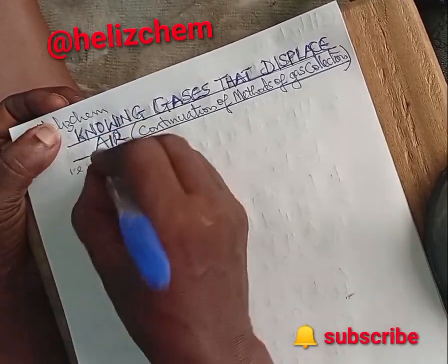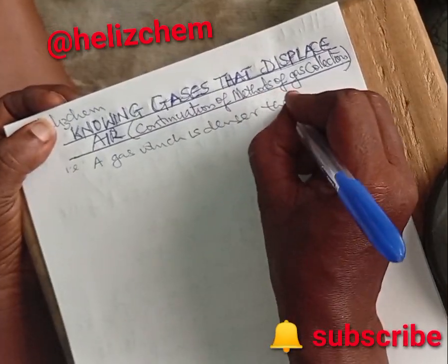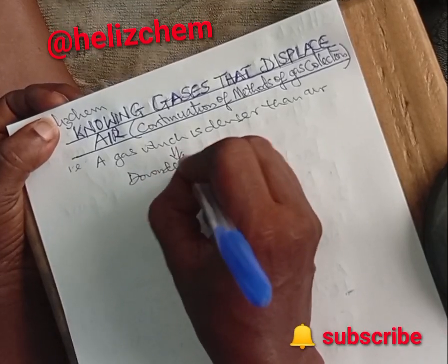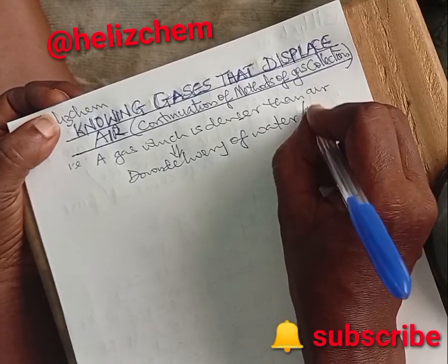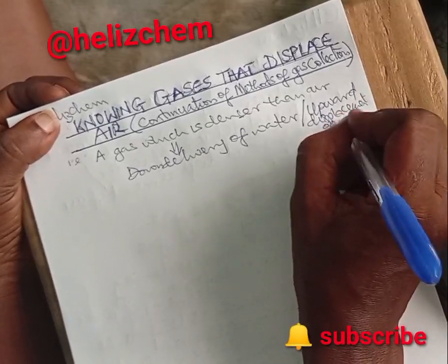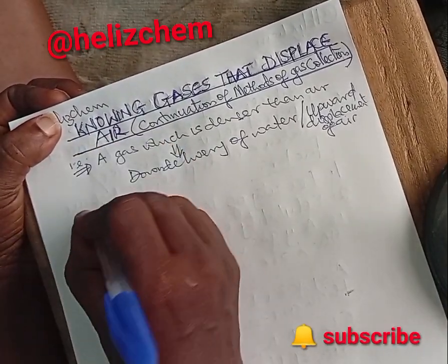That is, a gas which is denser than air will be collected by downward delivery of water, otherwise known as upward displacement of air.